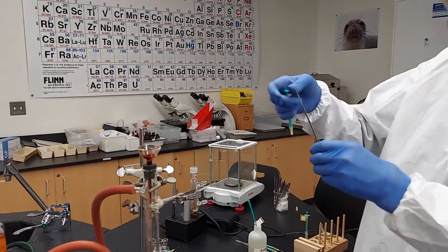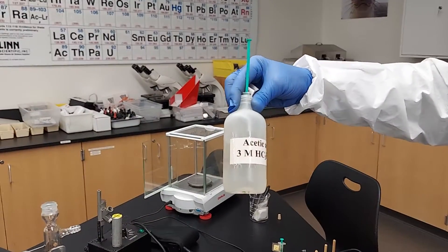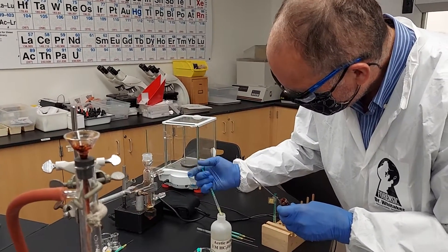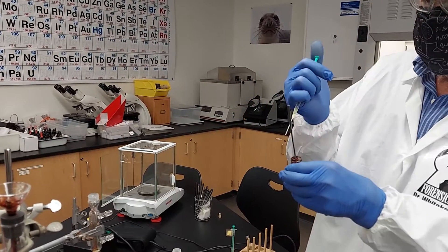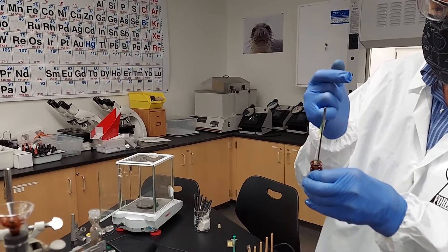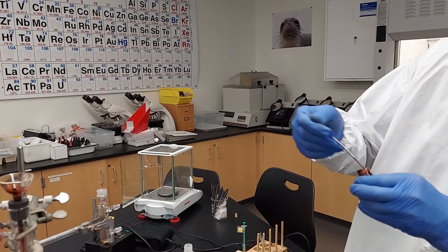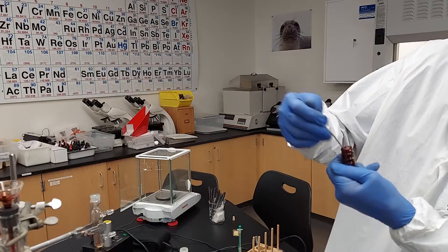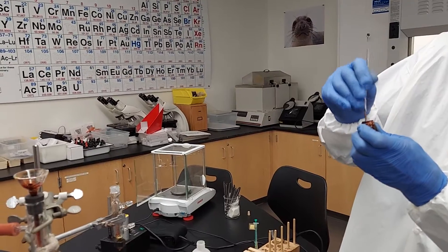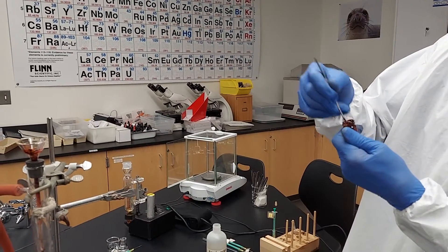The next rinse is with 0.5 milliliters of 3 molar acetic acid. The reason for this is we want the protonated form of our diazonium methyl red. We don't want the basic form, so this is a mild acid which will protonate our methyl red, and it neutralizes the base we've been adding as well.